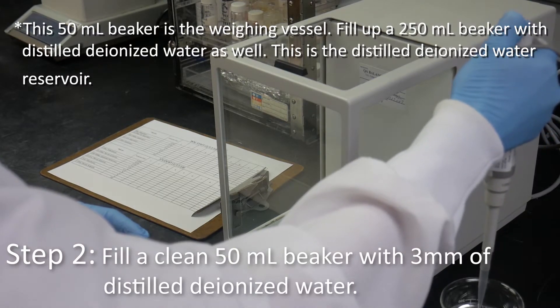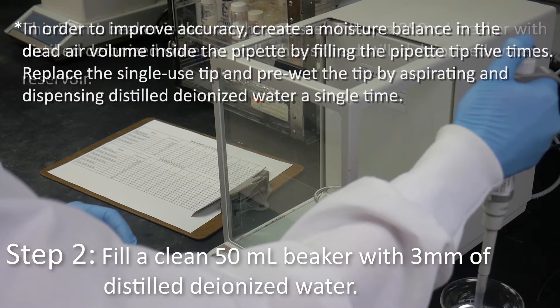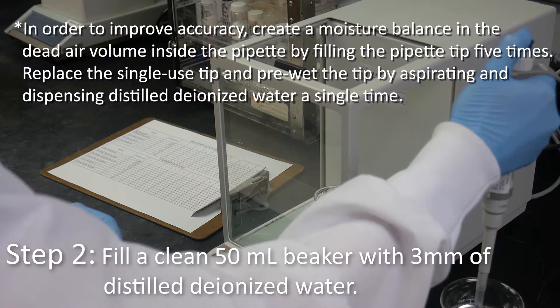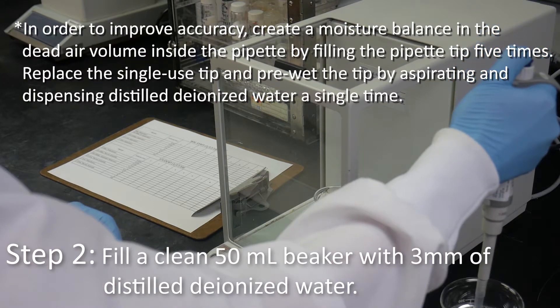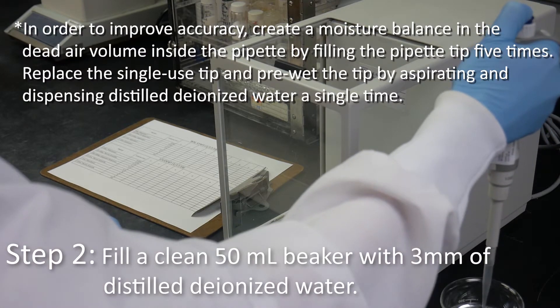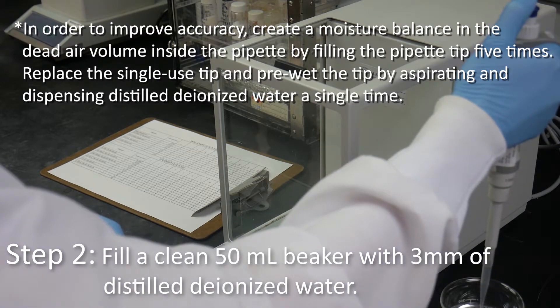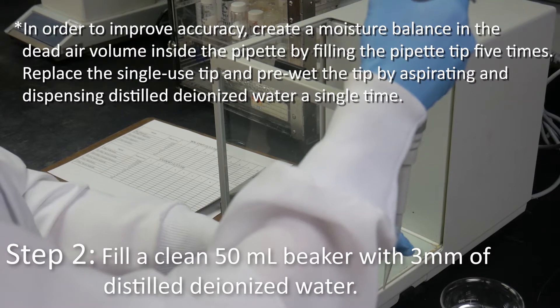This is the distilled deionized water reservoir. In order to improve accuracy, create a moisture balance in the dead air volume inside the pipette by filling the pipette tip five times. Replace the single-use tip and pre-wet the tip by aspirating and dispensing distilled deionized water a single time.